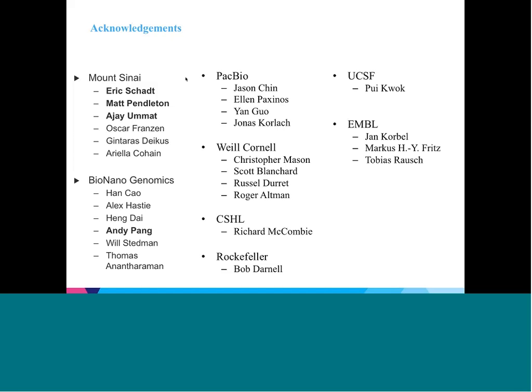The average SNP distance on this genome may be several kb, but we'll usually have at least a few reads that are in the 6 kb plus range, and so we typically hit at least a couple SNPs in that process. On the genome map side, right now the way we're doing it is by looking at molecule pileups, like the ones that Bobby showed, and we're using that to validate large structural events.